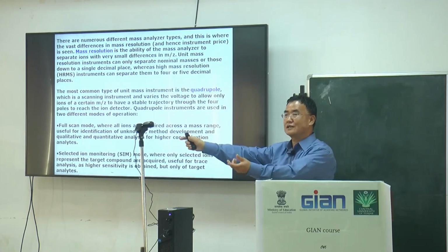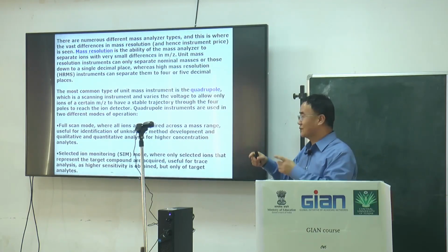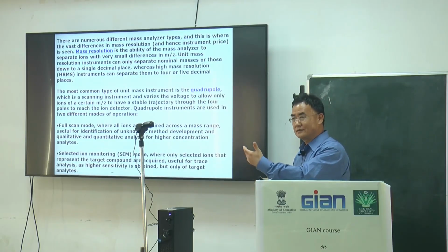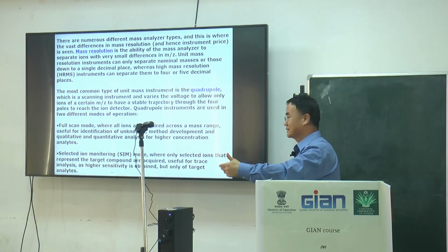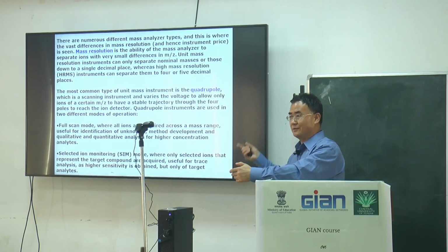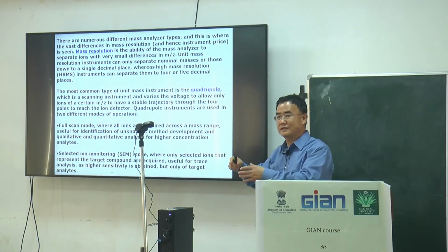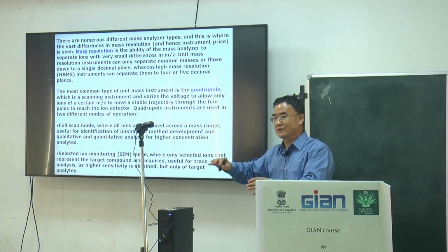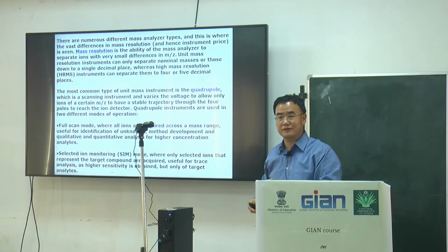Because when a large molecule is broken down, only certain, regularly broken fragments represent the lipid and can distinguish this molecule from other molecules in a similar group, for example, phospholipids.